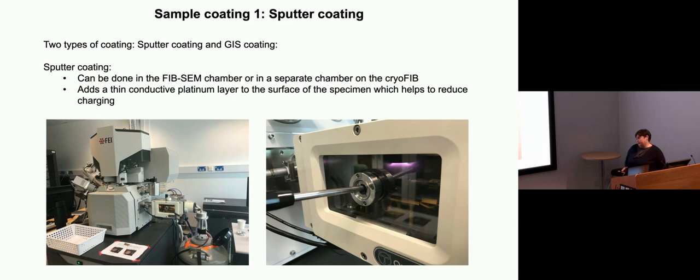This is one of our FIBs we have here. And this is our quorum chamber, which is used partly as an airlock for loading but also has this sputter coater. You can see the nice purple glow and we add a fairly thin layer of platinum. This is important because our samples are insulators, they're ice, they are not very good for the SEM and the milling. This helps to prevent charging.